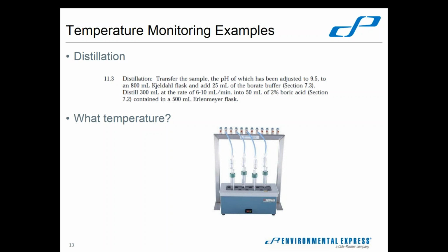So then I went and I looked at a few different manufacturers' operator manuals, and there I actually do see temperatures. Some of them say 130, 135. That's our SimpleDist manual that has that in there. Some of them say 160 or 180 degrees.